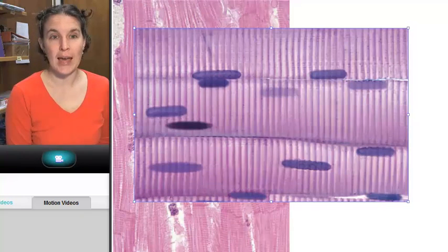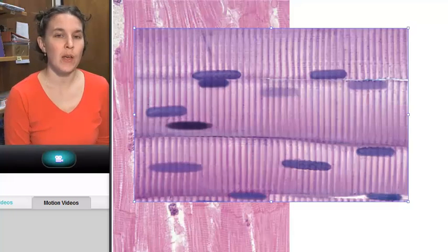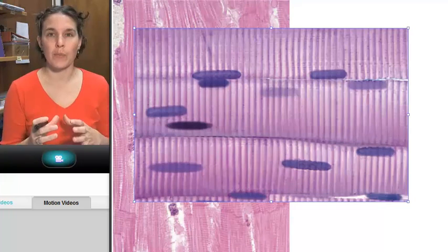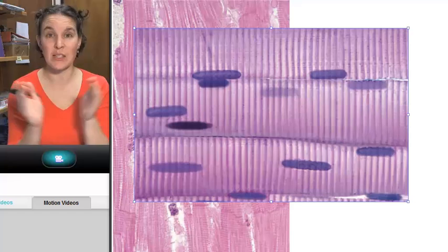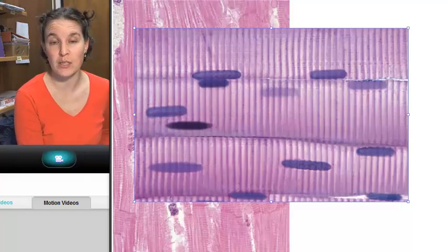Let's take a closer look at the histology of cardiac muscle tissue. Remember, muscle tissue is contractile, so there are going to be some similarities with skeletal muscle that we've already looked at.